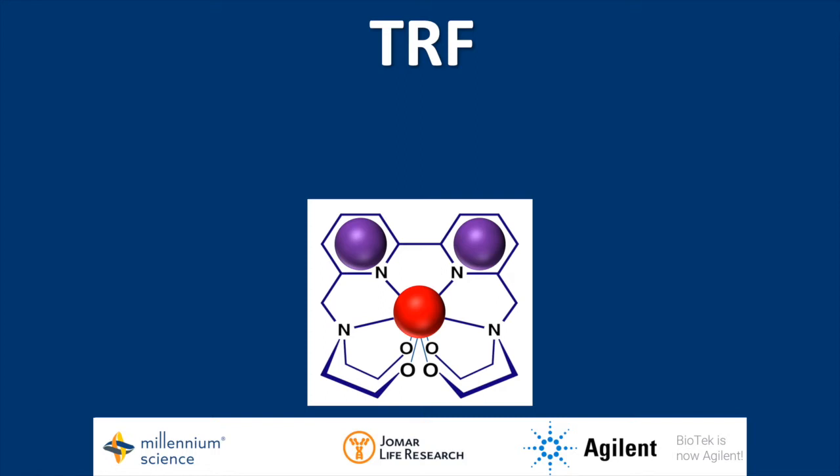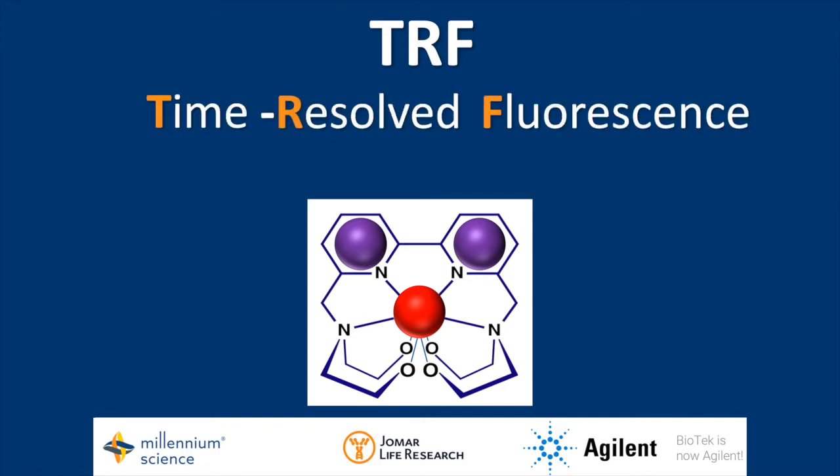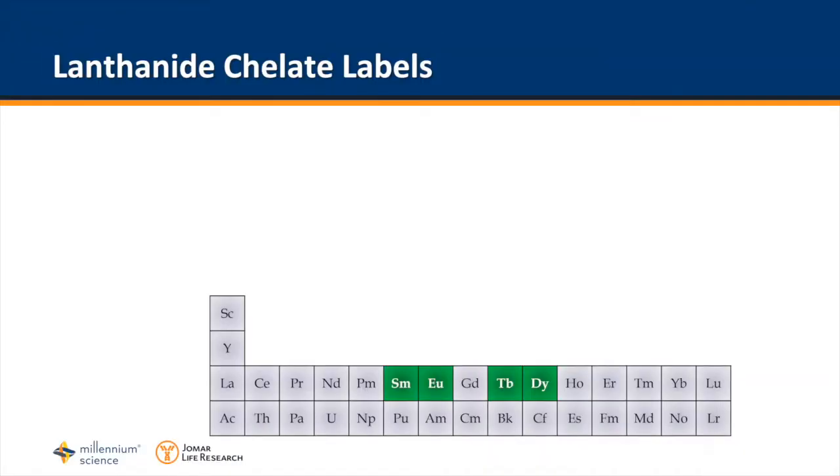This video is on TRF, Time Resolved Fluorescence. Part 1 of this video series is on Assay Technology Basics. So what is TRF? Time resolved fluorescence can sometimes be confused for kinetic assays, however they are two separate entities.